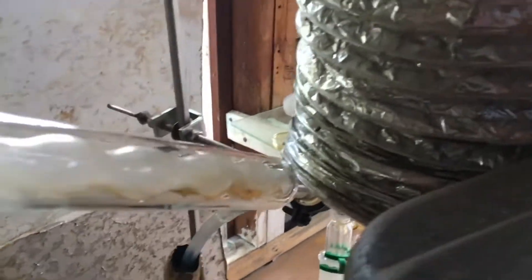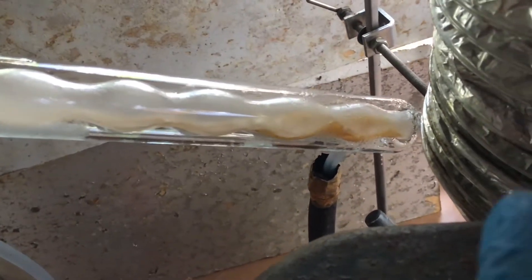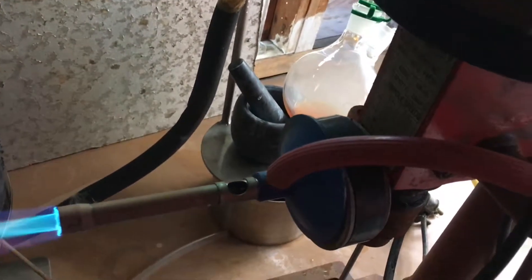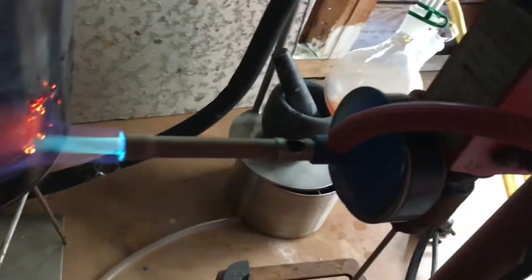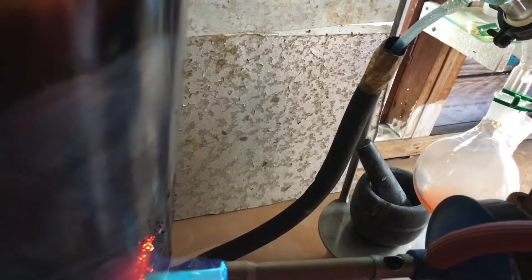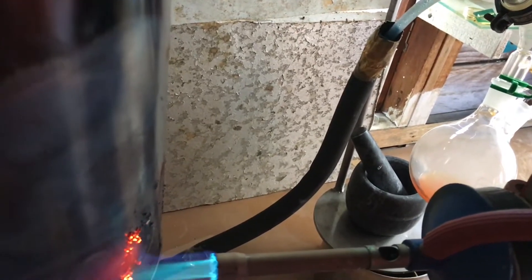The benzene seems to be freezing up in the column, as you can see. What I've decided to do is recycle the water in the condenser. I've also set up something to hold the tubing in place — it seems to be working better than me holding it.